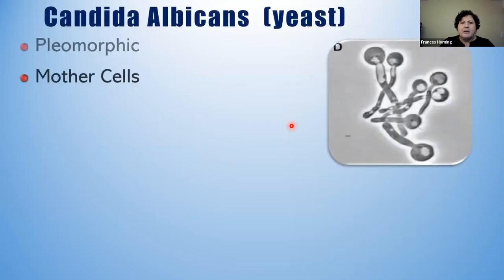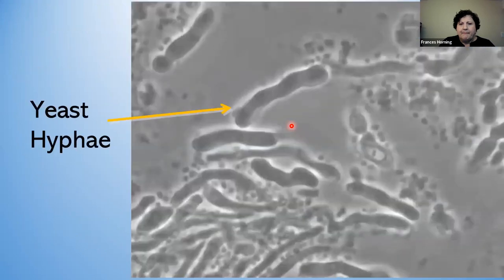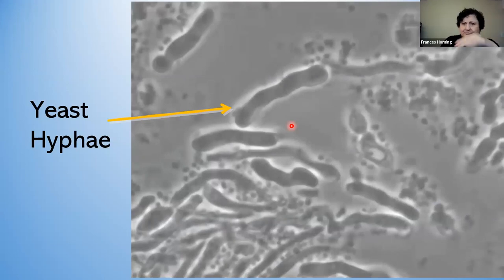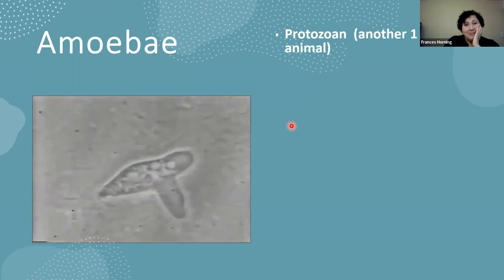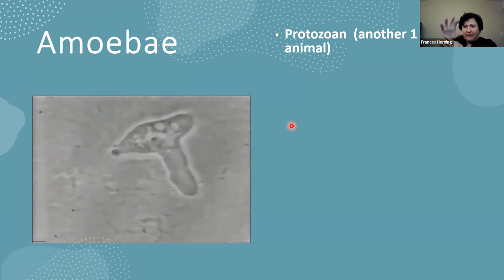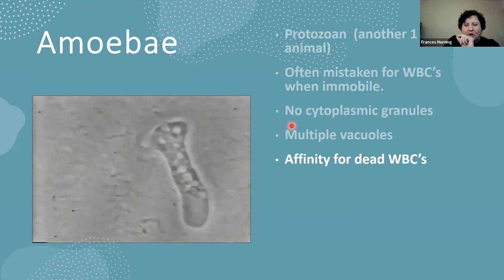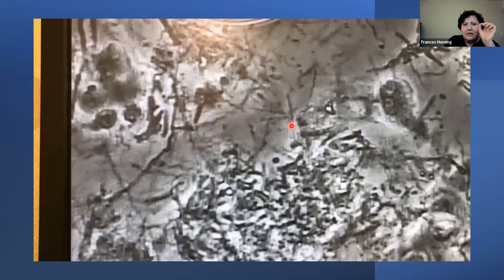These are candida — sometimes the mother cells and daughter cells can be confused with red blood cells. The hypha is not moving. Candida is opportunistic, so it's not causative in and of itself, but it can be a problem if you see a lot of it. Then there's amoeba — my favorite. They're a one-celled animal that uses a pseudopod to pull themselves around. Often mistaken for a white blood cell when not moving. The way to tell the difference: there are no cytoplasmic granules inside — there's a food vacuole inside the amoeba. In April 2020 it was found to be causative of periodontal disease.